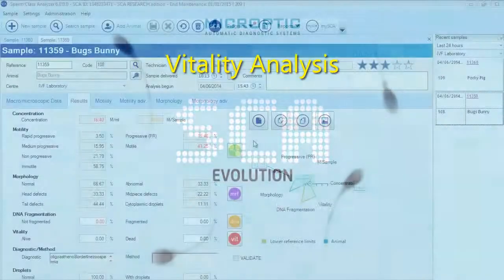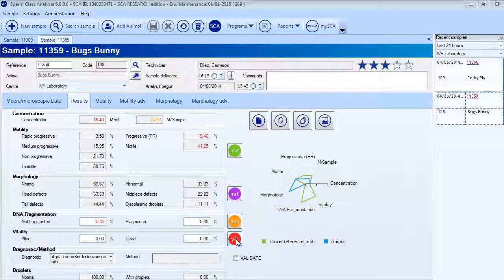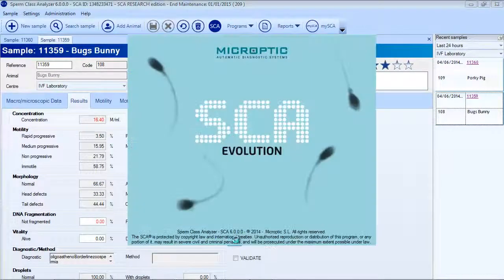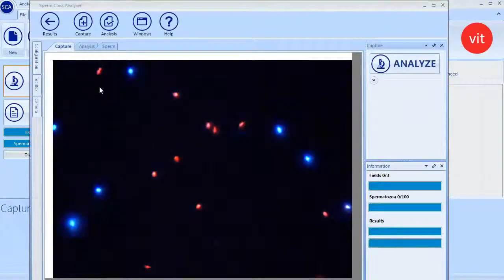Vitality analysis. Access the analysis module from the respective button in results tab or from the icons bar. This is the main analysis window where the sample information is presented. Press Analyze button to display the live image.